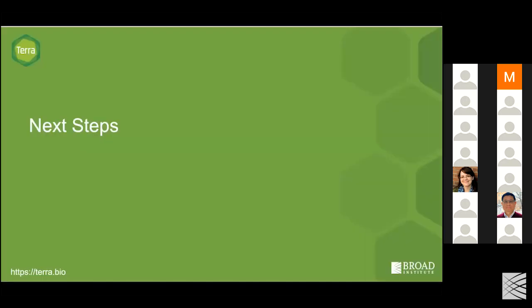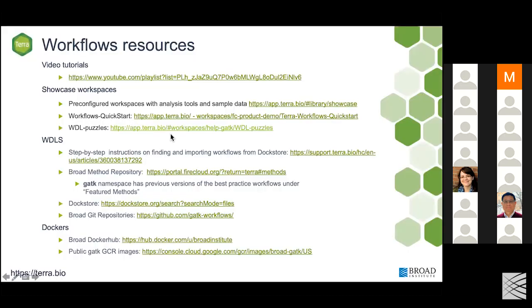All right, so just some next steps. We have some resources available that you can check out that are related to workflows, our video tutorials. Again, we have showcase workspaces that you can try to get more practice using workflows. We also have step-by-step instructions for finding WDLs both in Dockstore and the Broad Methods Repository. And we do have some links here to Docker resources as well.